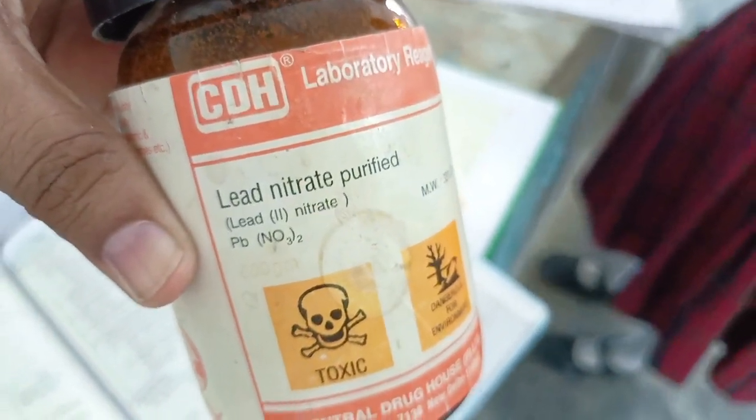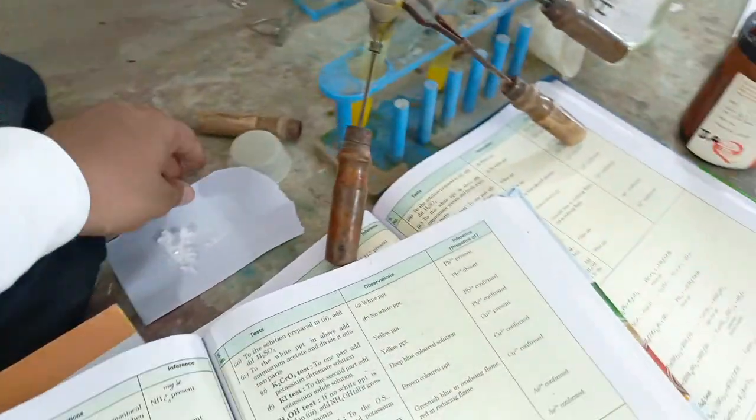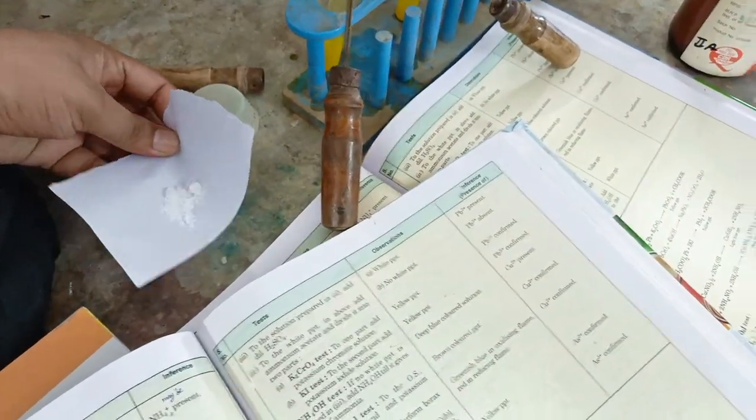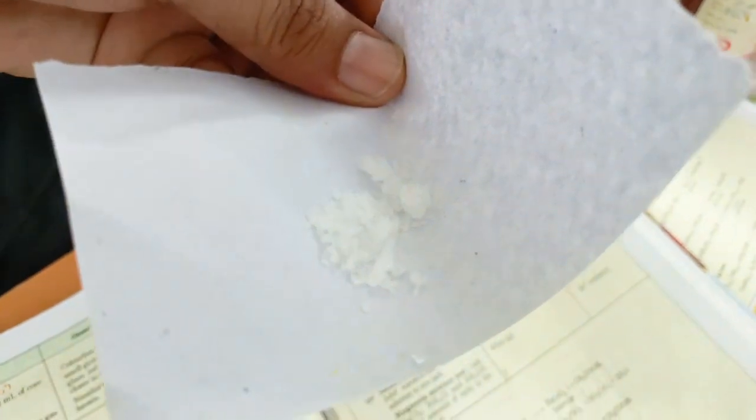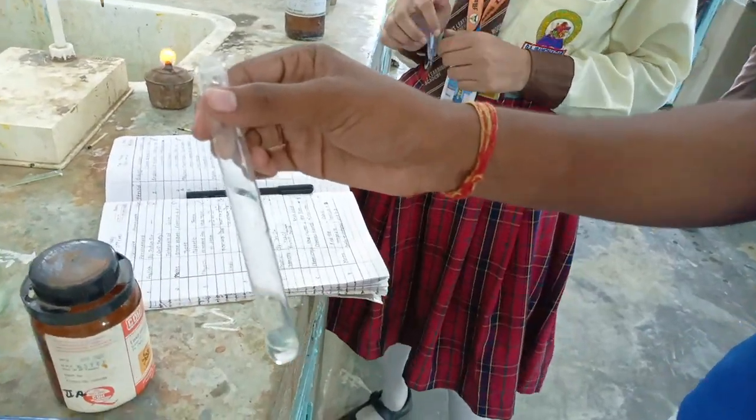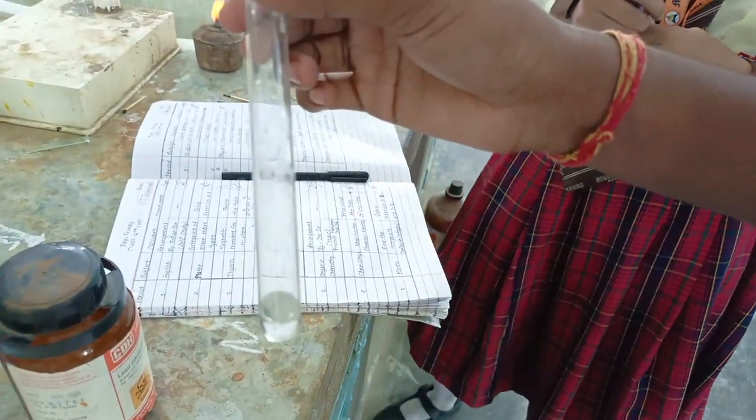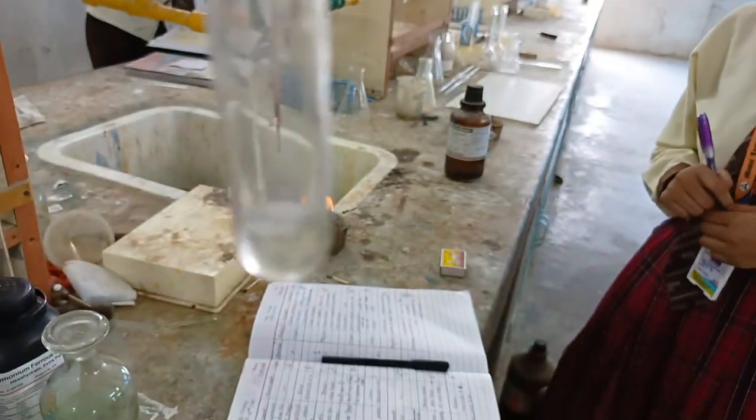Today we are going to perform a lead nitrate test. This is the salt lead nitrate. We will make the original solution by taking a pinch of salt and adding water, then we will take the transparent liquid.